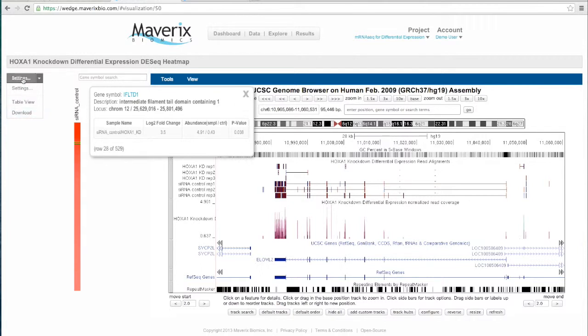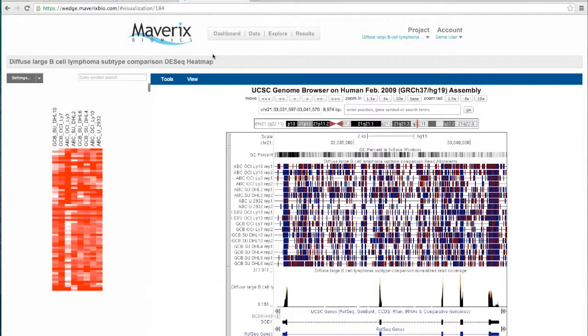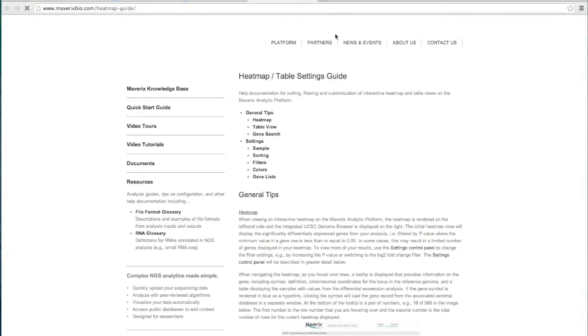So in order to show you some of the more settings that are available here, I'm going to switch over to a different heat map which has quite a bit more data in it and a lot more samples. And this will give you an idea of the sort of customization that you can do for the heat map. So if I open up settings, I wanted to show you one thing really quick. These little icons that are both within the settings pane as well as within the configuration panel when you're setting up your analysis will launch you into our knowledge base and provide some tips and guidelines for how to use the settings.